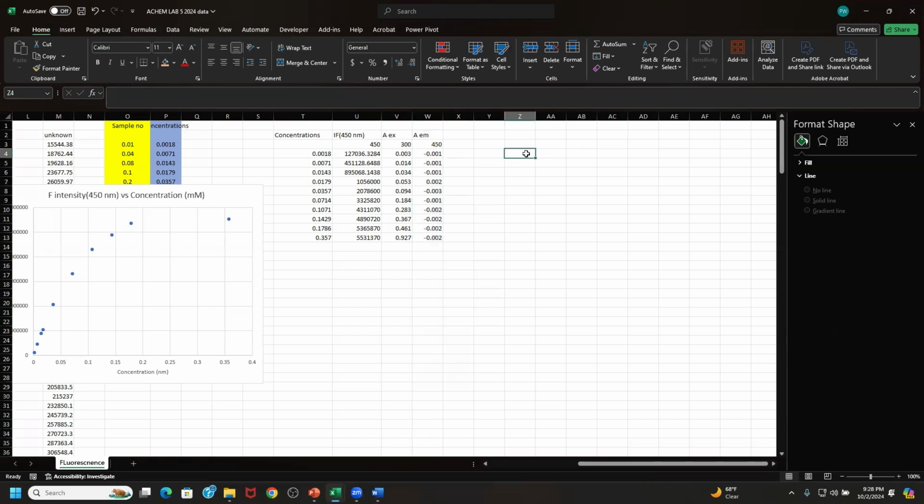Okay. Now I'm going to plot here. I'm going to include an equation where I'm going to select my as acquired fluorescence intensity, and I'm going to multiply it by 10 to the power. I'm going to include a couple of parentheses here.